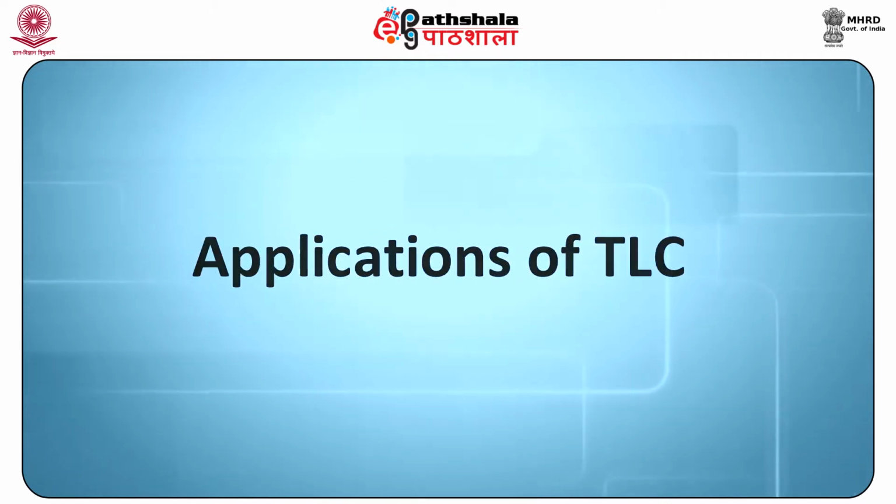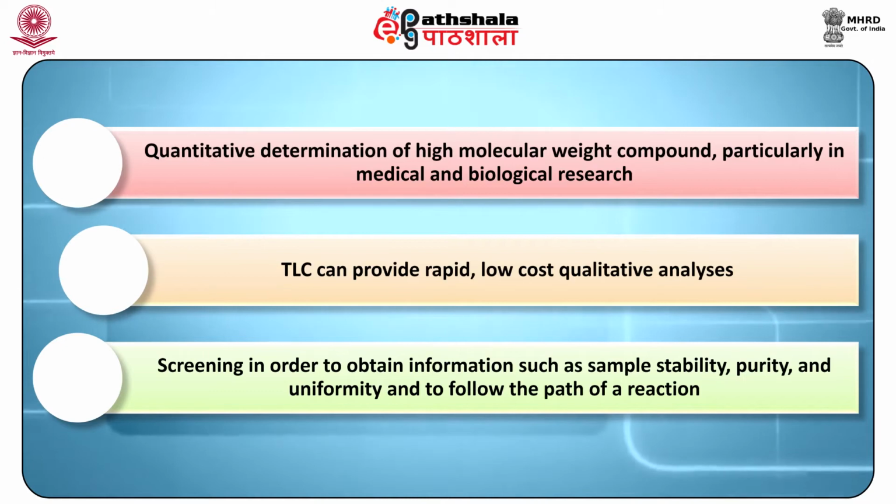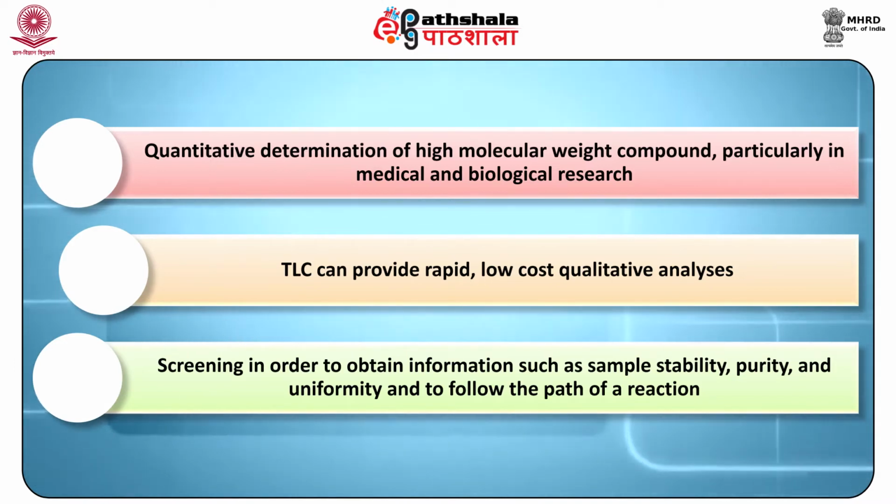Applications of TLC. Quantitative determination of high molecular weight compounds, particularly in medical and biological research. TLC can provide rapid, low-cost qualitative analysis and screening in order to obtain information such as sample stability, purity and uniformity, and to follow the path of reaction.